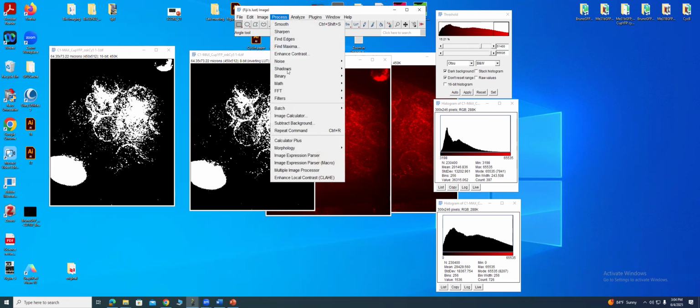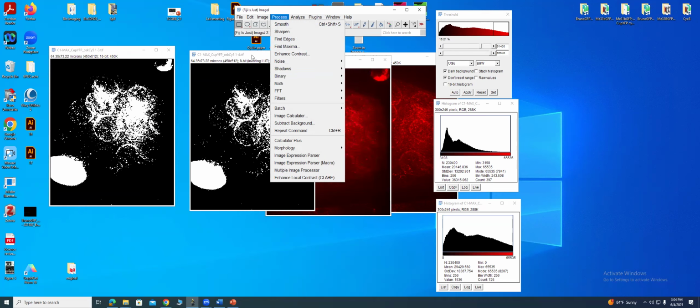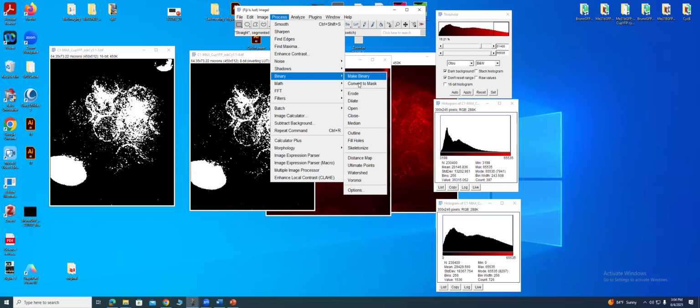So those are the options here, right? So again, you want to threshold it, and then you want to make it binary. And once you've made it binary, you can play with the options of erosion and all that stuff. These are the different things that you can play with on your own. What I do want to point out is this watershed option that we talked about.